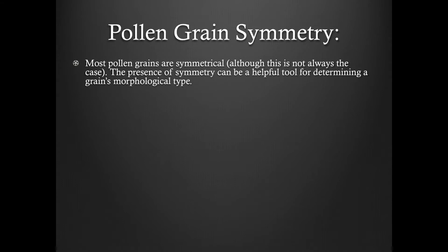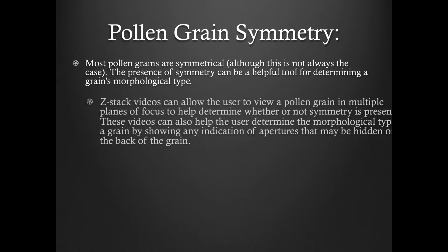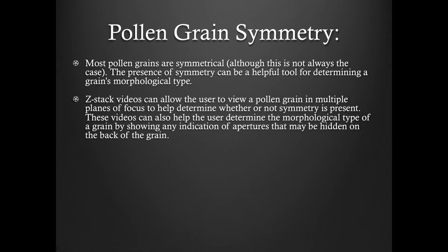Most pollen grains are symmetrical, although this is not always the case. The presence of symmetry can be a helpful tool for determining a grain's morphological type. ZStack videos can allow the user to view a pollen grain in multiple planes of focus to help determine whether or not symmetry is present. These videos can also help the user determine the morphological type of a grain by showing any indication of apertures that may be hidden on the back of the grain.